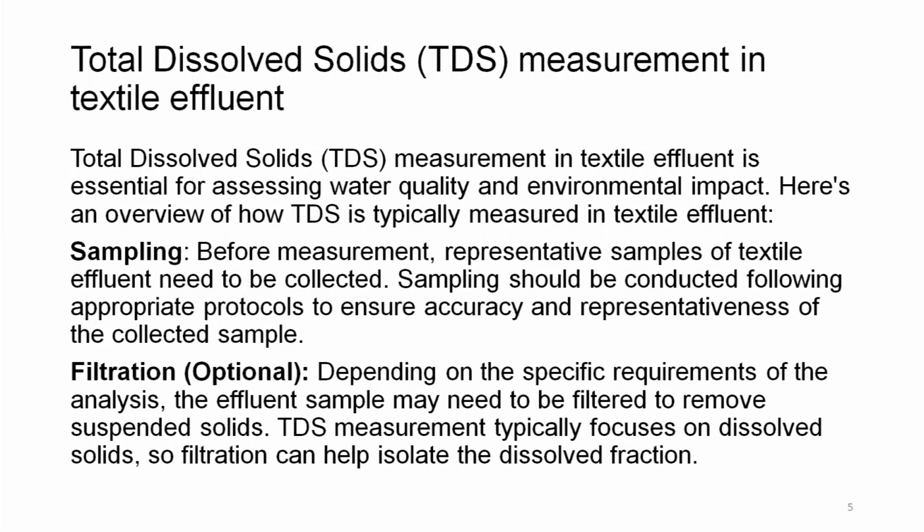Depending on the specific requirement of the analysis, the effluent sample may need to be filtered to remove suspended solids. TDS measurements typically focus on dissolved solids. So, filtration can help isolate the dissolved fraction. So, any suspended solids should be removed when we are analyzing TDS.